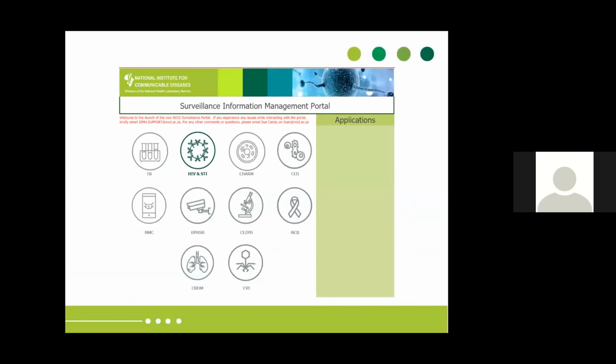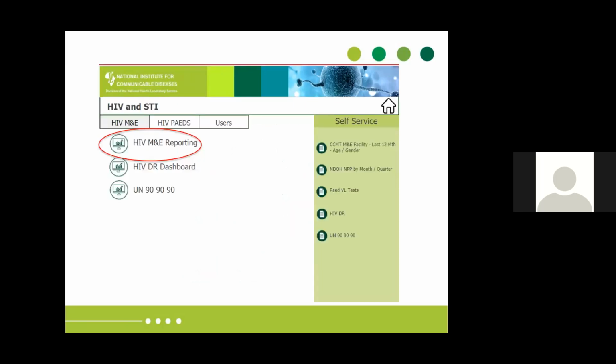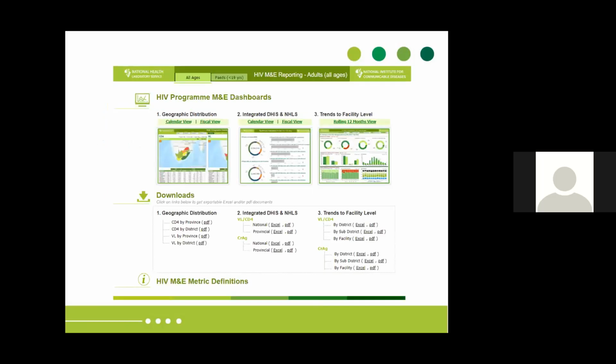So just to put things into perspective, obviously the monitoring of the HIV program is just one of various programs that the National Institute of Communicable Disease is interested in. We have various units ranging from TB to respiratory diseases and vaccine preventable diseases. And all of these various units do use routine laboratory data. But I'll delve into what we do at the Center for HIV and STIs with regards to HIV viral load monitoring. This is what our portal looks like. This is on the MicroStrategy portal that we've developed, and I'm just using our interface as a means of introducing the various reporting modules. So this is the HIV M&E dashboard that I'm going to have a brief look at with you, and you can see that there are various modules within the dashboard.